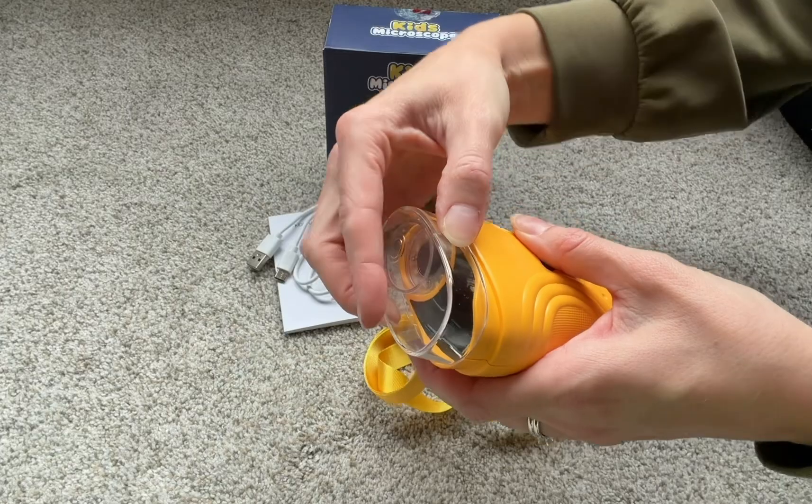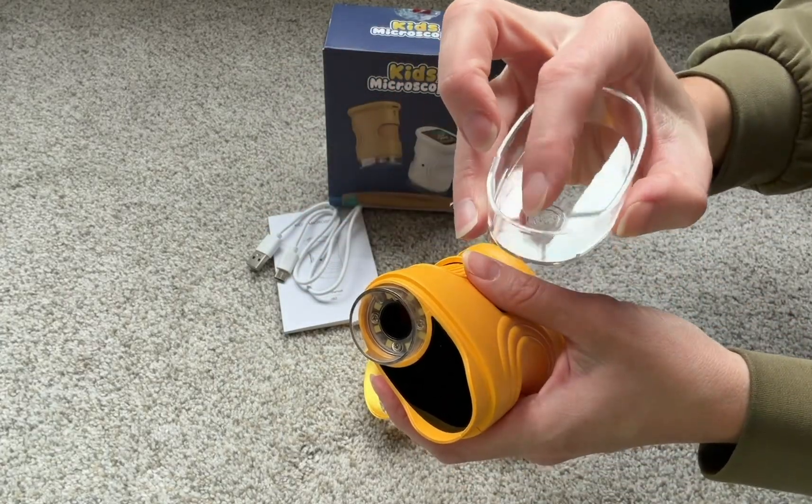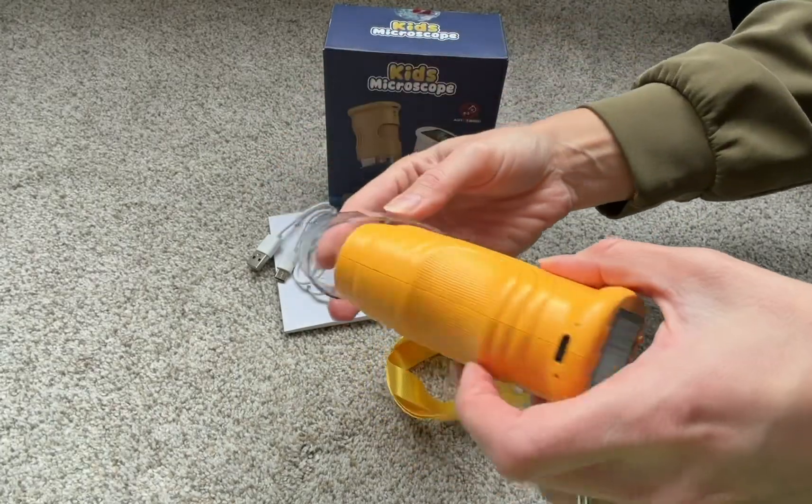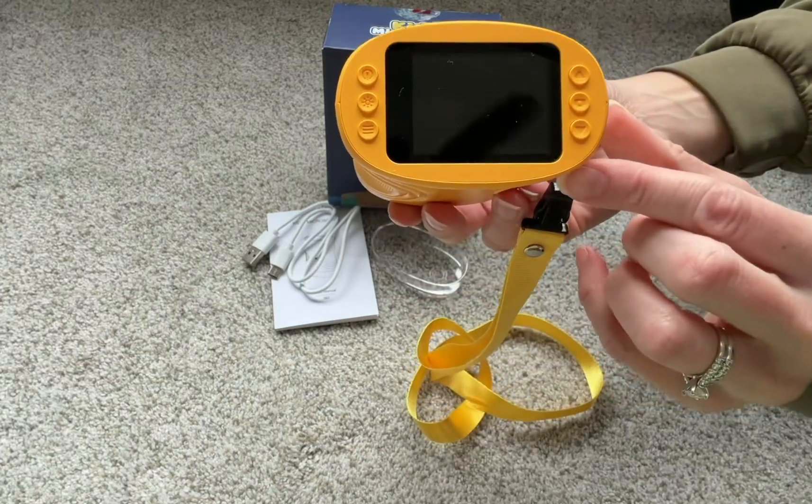The cap is also a specimen tray, so you can put different specimens in there — if it's small or something — and view it that way. It will snap right on, and you can turn it around.